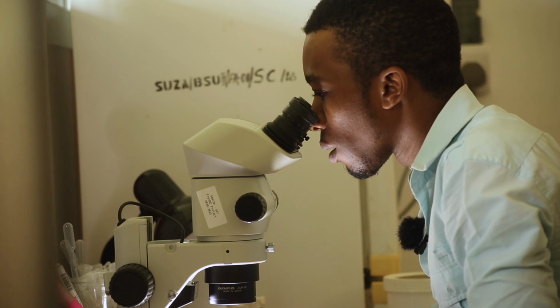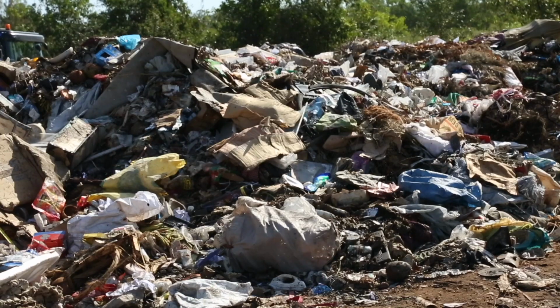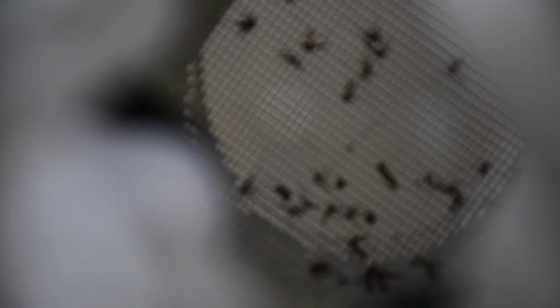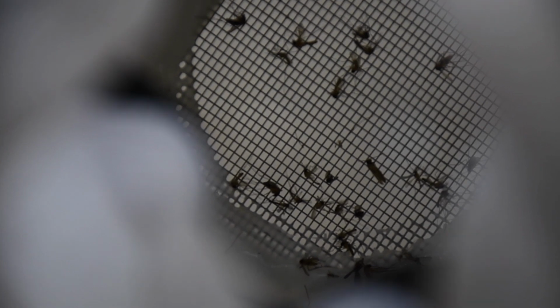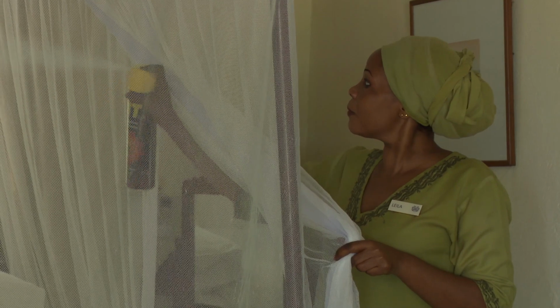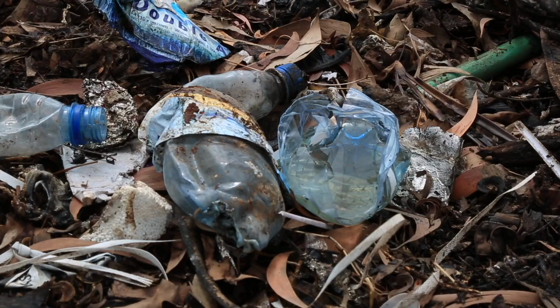Research on mosquitoes could focus on larvae or adults, or in some cases both. If your interest is in larvae, the variables of interest could be the number of larvae, where they breed, the type of habitats, and the species of these mosquitoes. If you're focusing on adults, your variable of interest could be the feeding habits of the mosquitoes, the density of adult mosquitoes, insecticide resistance status, and other variables depending on your research objective.